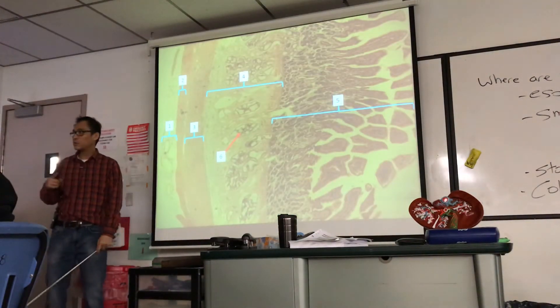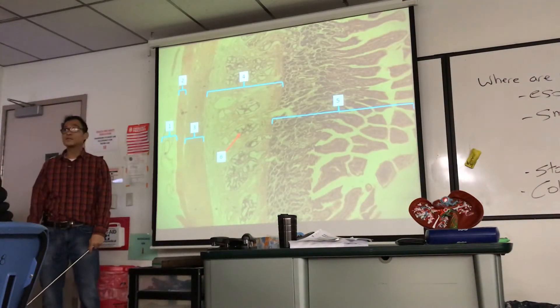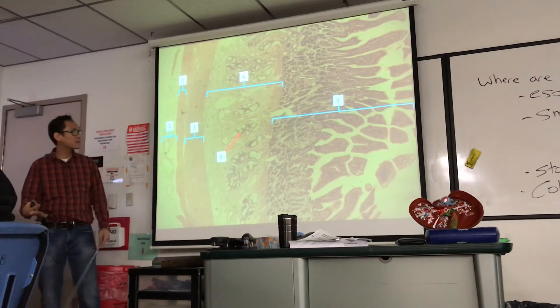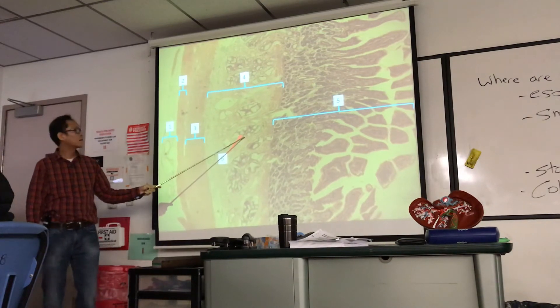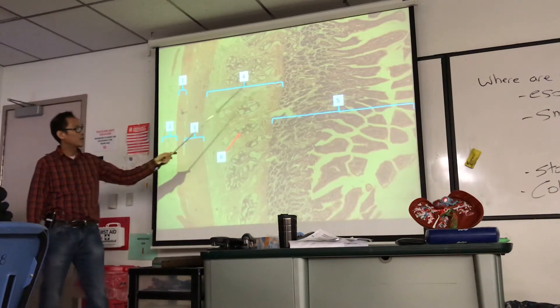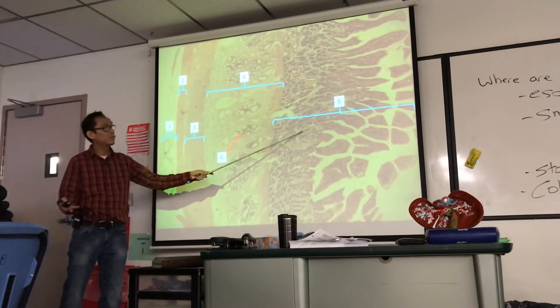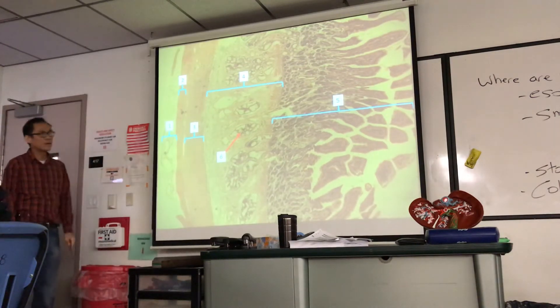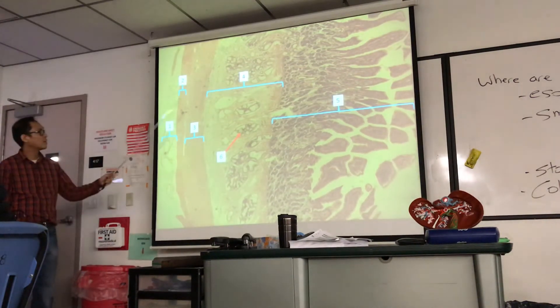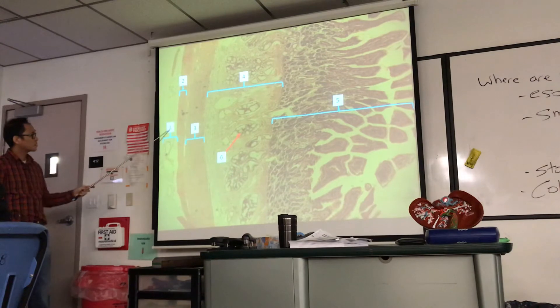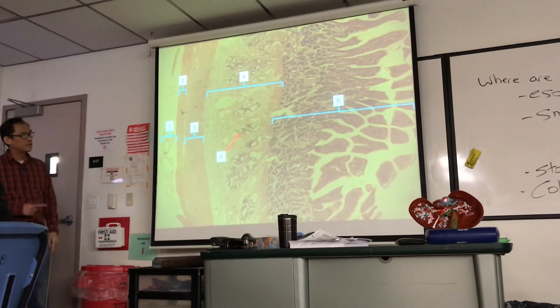Moving on from stomach to small intestine. This is the duodenum, so what do you expect to look for? Brunner's glands — boom, number six. They're within the submucosa. If number four is submucosa, number five is mucosa. Numbers two and three are the layers of muscularis externa: longitudinal layer, circular layer. Number one: serosa or adventitia. This is the duodenum.